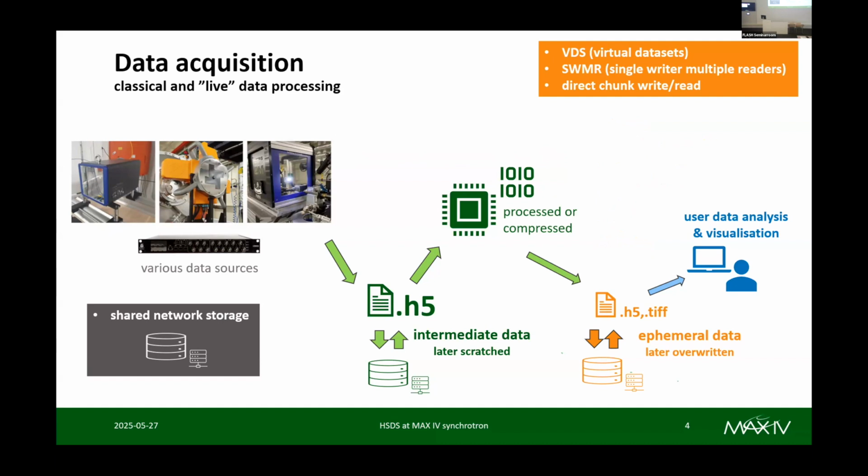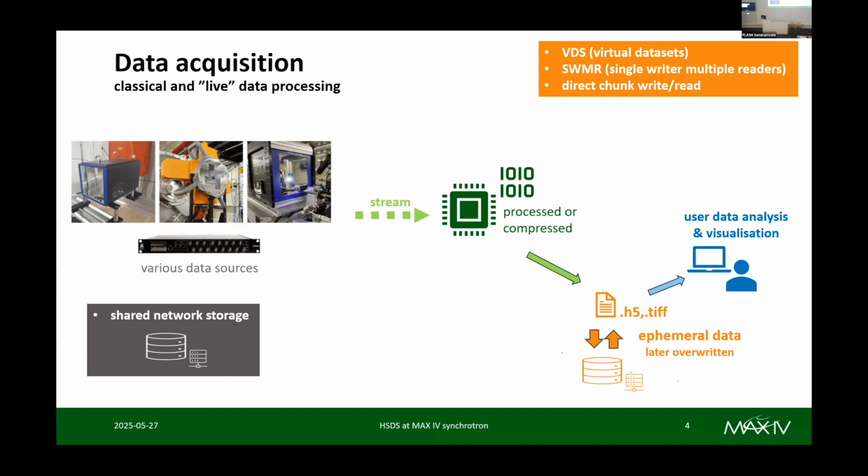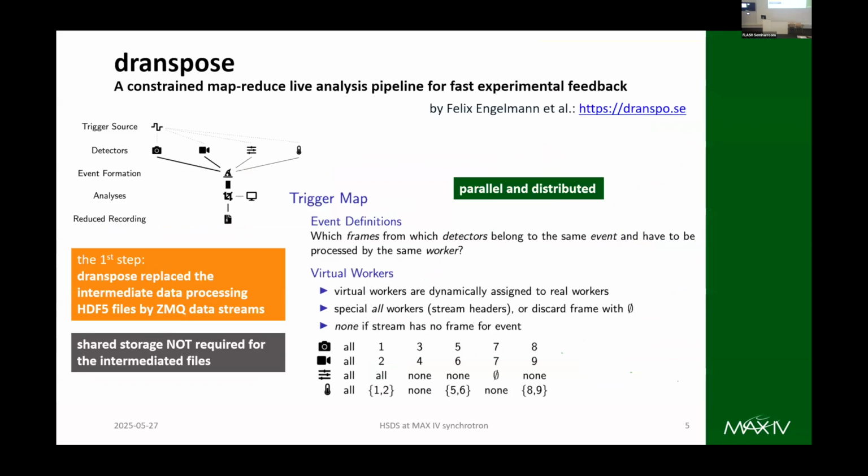And in this context, it is now popular to start using streams, replacing the first stage by just data streams. So we inject data by data streams directly into the processing pipelines. Then we again produce some results and we visualize them. Yeah. And for that at MAX IV, we are using a product developed or invented by Felix.